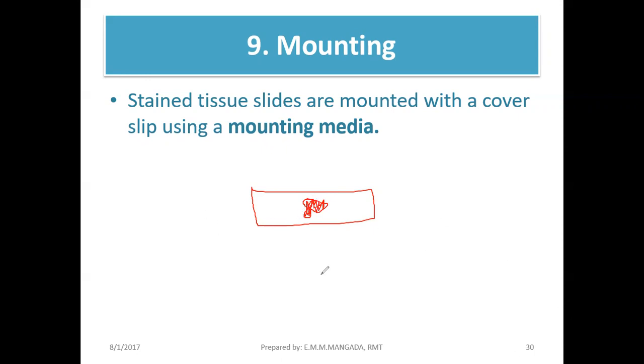It's okay to view it like that, but it's not as clear as when you have the cover slip. One purpose of the cover slip, attached with the mounting medium, is that it gives a higher refractive index, so the tissue looks clearer. Other than that, if you don't cover the tissue with a cover slip, the stain will fade. And when we store it exposed, there's a tendency that it will be eaten by rats, or in Ilocano, bau, or balakak in Ibanag.